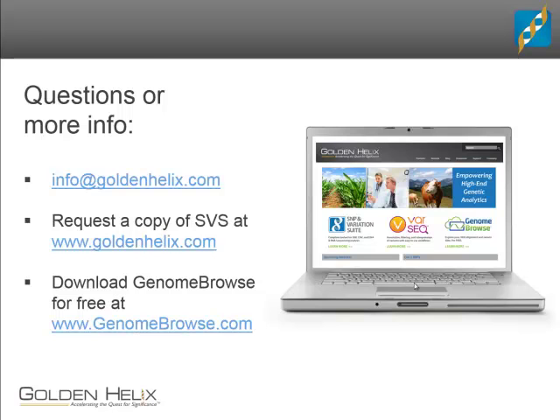I expect that most of the time if you have sequence data, you'll already have that format. Now, if you don't have VCF files, there are a number of other supported formats. Of course, we read in a lot of the standard things from GWAS programs like PED files or the Plink binary version of PED files, or just standard flat text files. So a lot of options there.